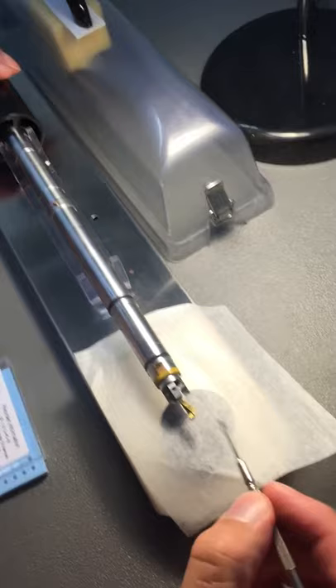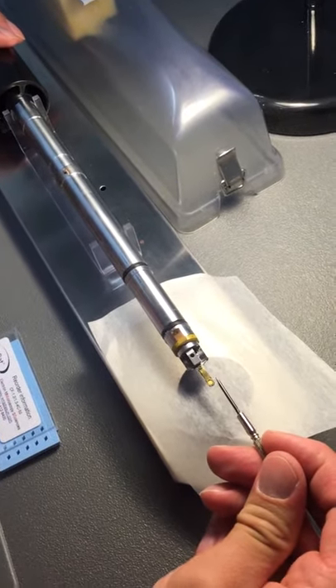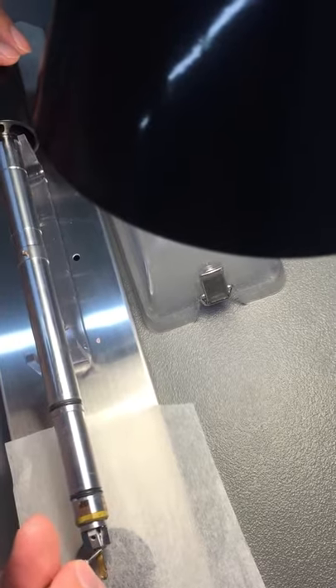I want to see how it works. There we are — I'd say you'll need to cut a little bit. And again, we don't want to over-tighten the screw because we could break it.